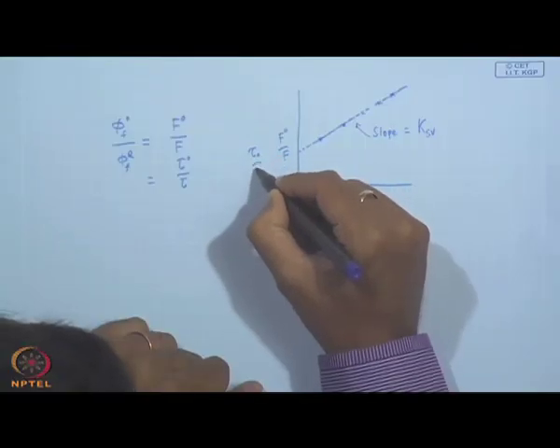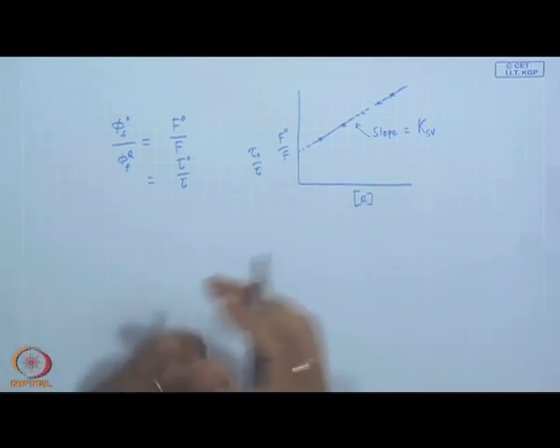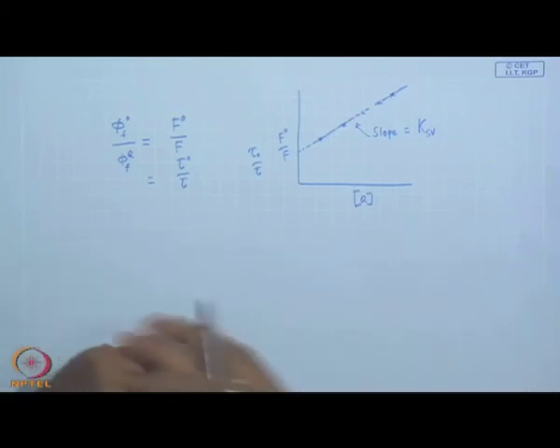So, if you can monitor this radiative lifetime in presence of quencher and in absence of quencher, as a function of quencher concentration.